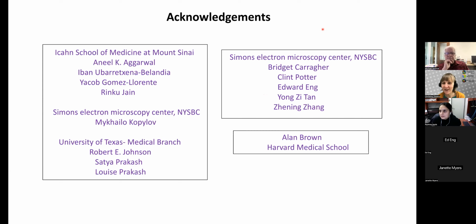There was a question about your tilted collection. What was the actual degree of tilt you used for your different data sets? Okay, so for the ternary complex, we used 40-degree tilt. We did try lower tilts, but that did not work, so we had to resort to a high tilt of around 40 degrees. And for the other projects also, it was high tilt, around 30 to 40 degrees.